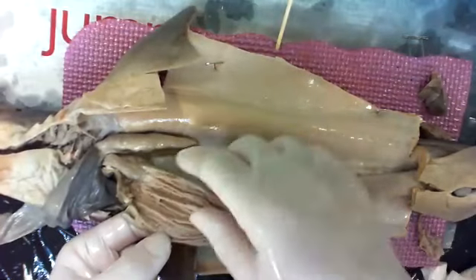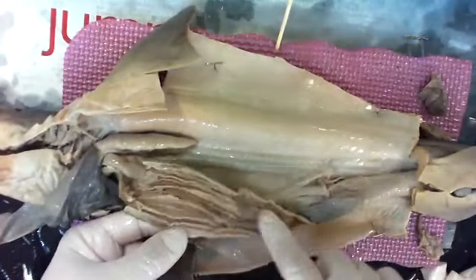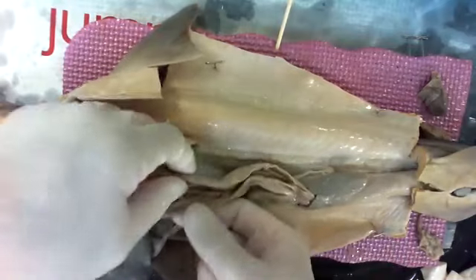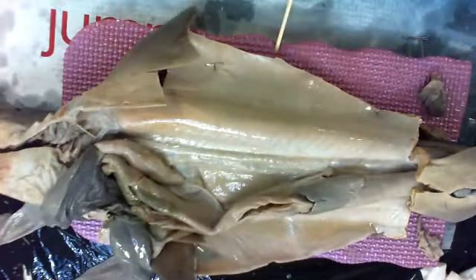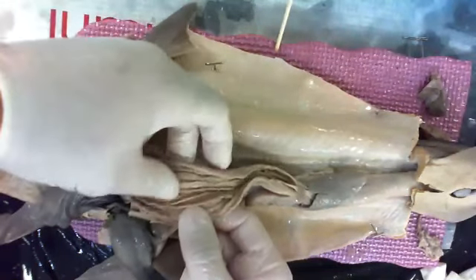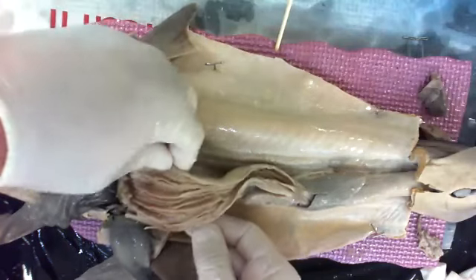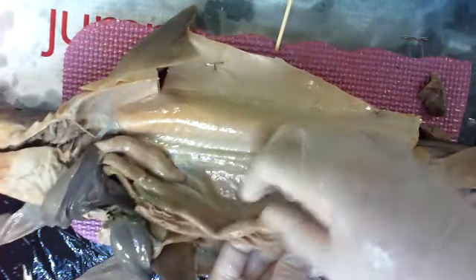That's the stomach. See all the lines? When the lines go straight like that, they're called rugae. And rugae allow the stomach to stretch when you're filling it. So if you go to a Chinese buffet and you like to eat a lot of food there, stretches open. When the animal is preserved, it's not stretchy anymore. It's hardened. But it would stretch and stretch and stretch. Mine didn't have a last meal, it looks like. It's sad.